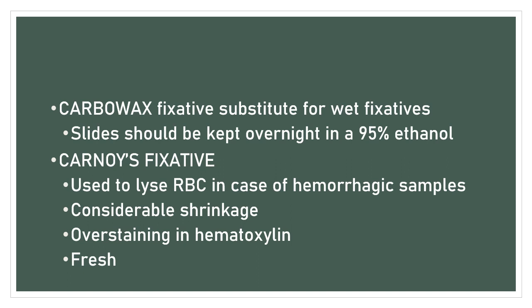But then it causes considerable shrinkage and overstaining in hematoxylin. And so your Carnoy's fixative should be fresh. And so when you use it, it should be fresh. And when it is old, replace it. Okay, and so that is for your fixatives.